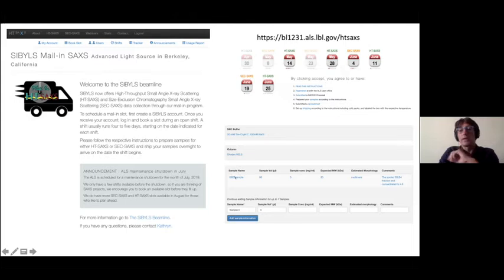And then we have another important part, the sample names and sample volume. That's the minimum you need to put in your sample spreadsheet. We allow 7 samples per user. And the concentration is again the question, what is the size? Greg already mentioned it, I was hoping. But for size exclusion SAXS, you can imagine you have a separation in a column, so you need a little bit higher concentration than for the batch mode, for the high throughput SAXS.